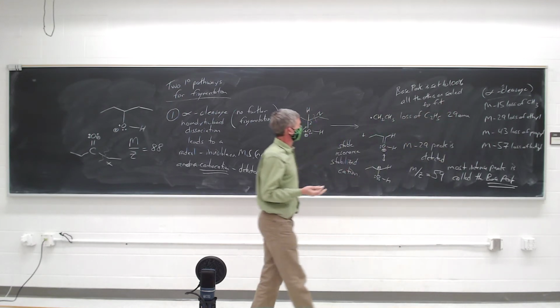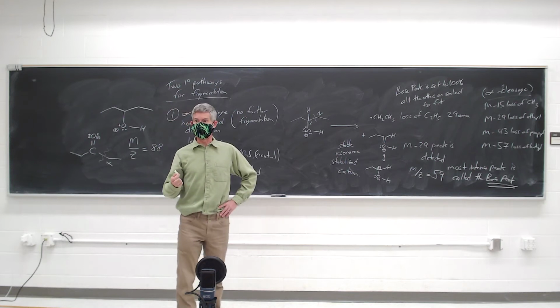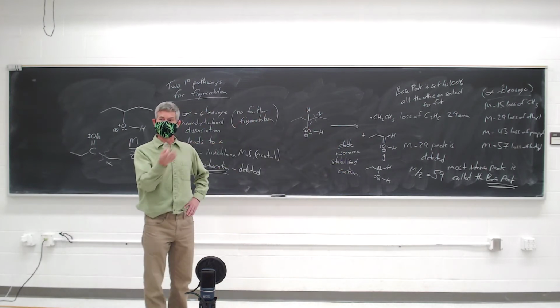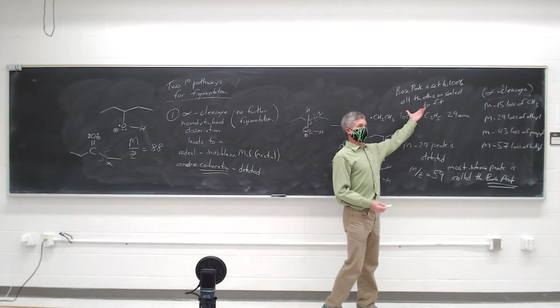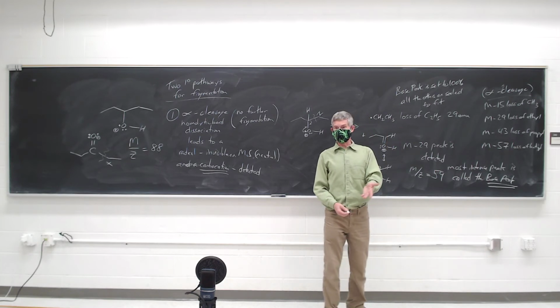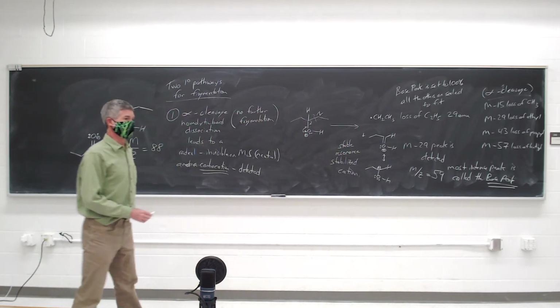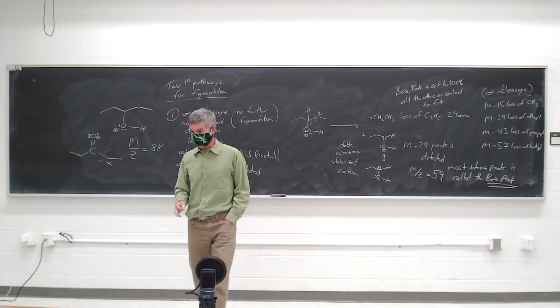So what you see when you see the mass spectrum is the total ion count. The total ion count might be 3.5 million, right? Because there are lots of these molecules going through the system, and they're all being fragmented the same way and crashing into the detector. So you might actually see 3.5 million individual ions. If it's the base peak, we're going to divide through by 3.5 million, multiply by 100, and just call that 100%. And then we will scale the total ion count to a percentage.